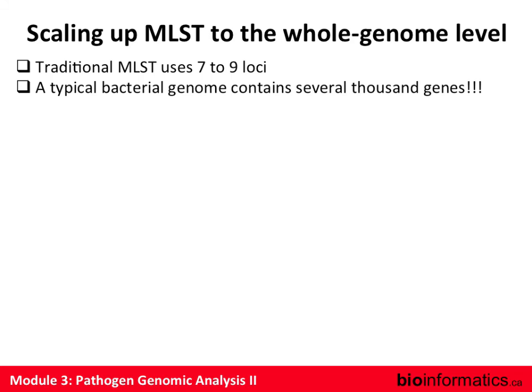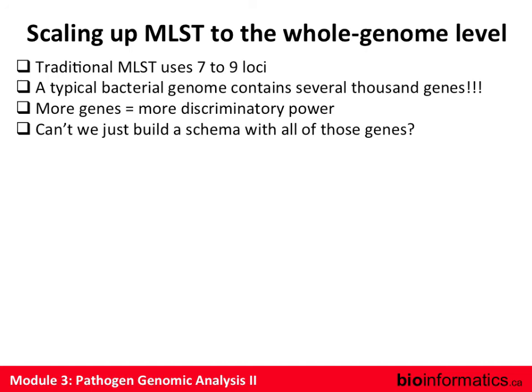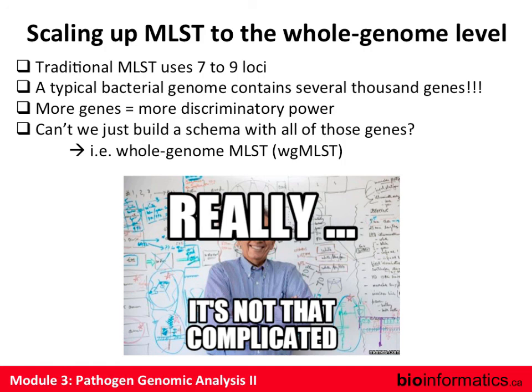That means that you have greater discriminatory power, more resolution to be able to say, oh, these guys are really similar or they're really different. So can't we just take whole genome sequence data and start analyzing thousands of genes? That makes sense, right? Simple. It doesn't seem like it should be that difficult, except that it is.